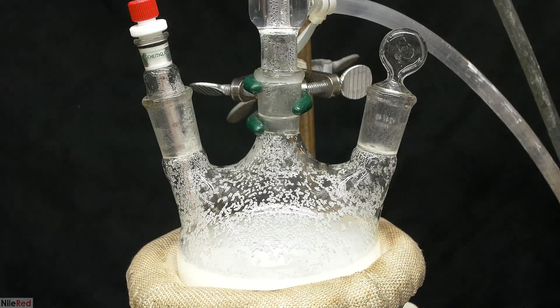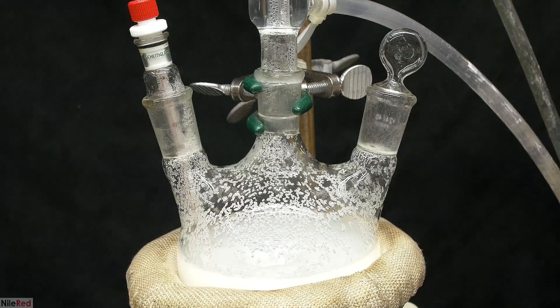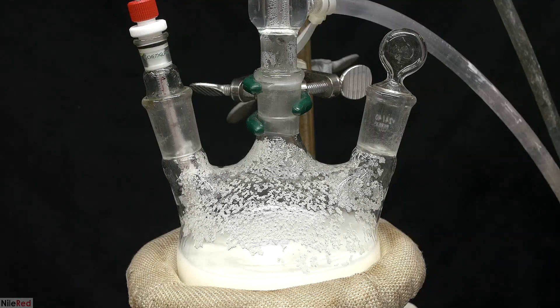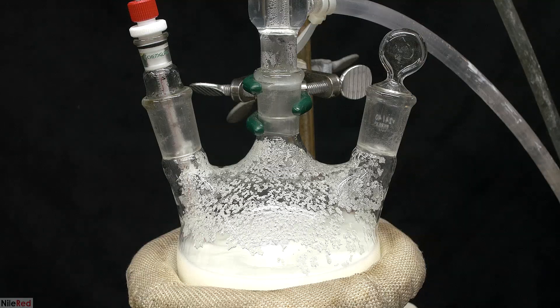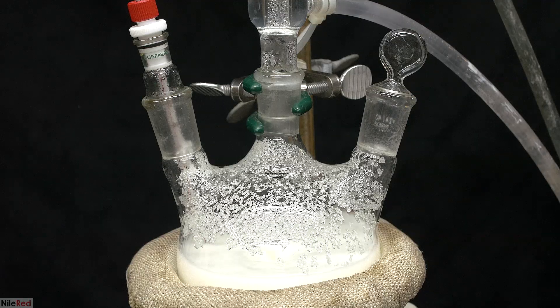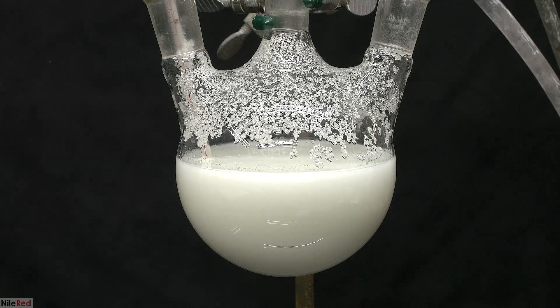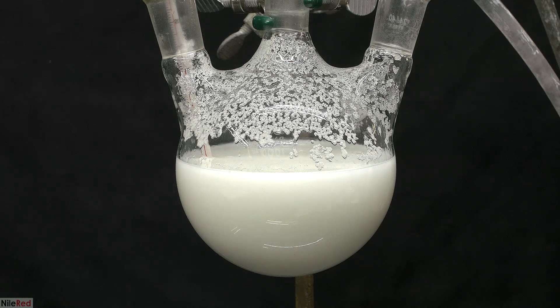Around the 15-hour mark, the solution started to become opaque, as adipic acid precipitated out. Over the course of the next 5 hours, a lot more adipic acid was formed, but it was more or less pretty mundane. At the 20-hour mark, I took off the heating mantle, and I let the mixture cool overnight.